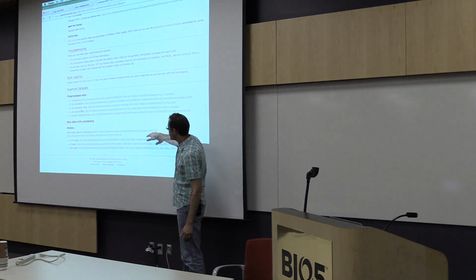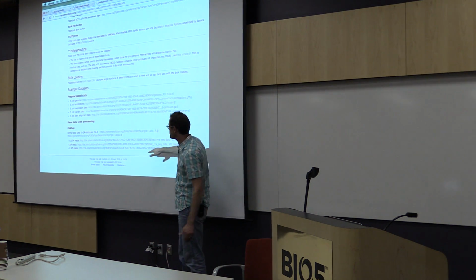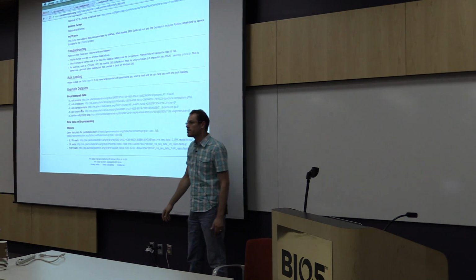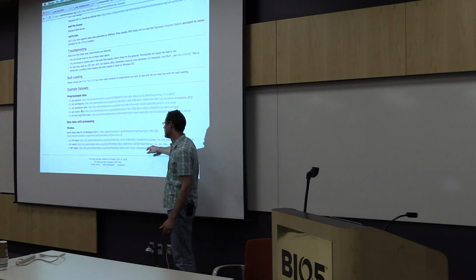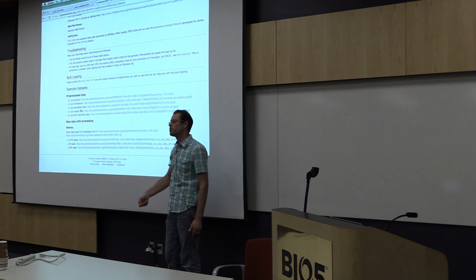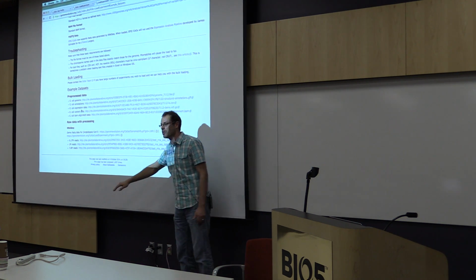So here's some RNA-seq data that we're going to be associating to an Arabidopsis, just like in the other example. And down here we have 3 different densities of data. One with 170,000 reads, one with about 1 million reads, and then one with about 7.5 million reads. Because I want you all to run this, and I want this to actually complete in a very short period of time, we're going to go for this small data set, the 0.17 million reads.